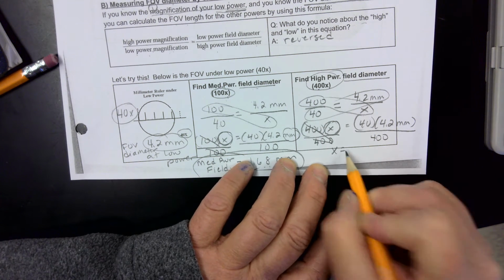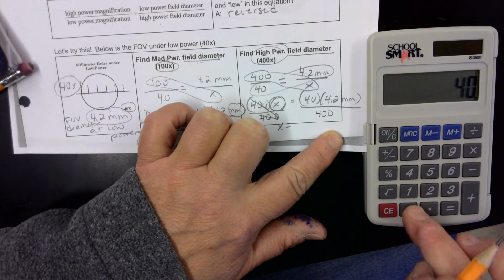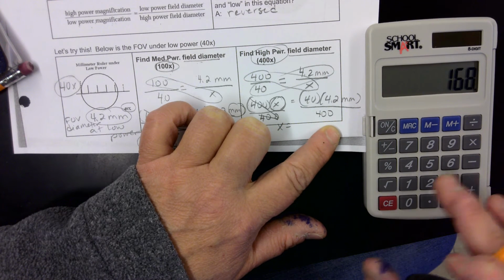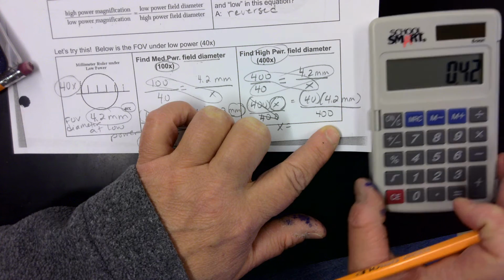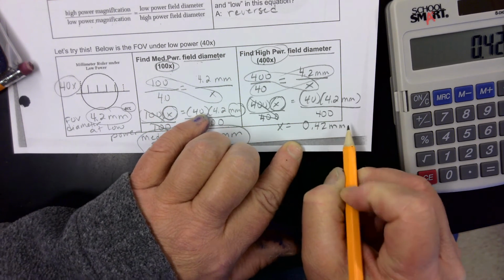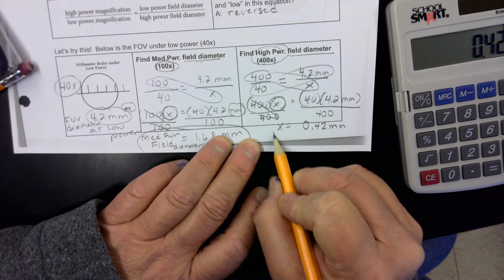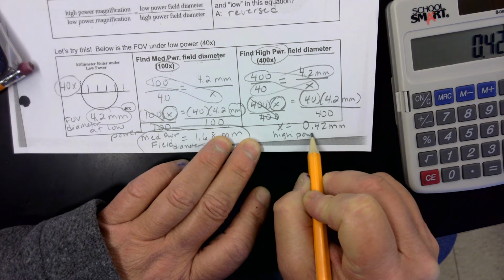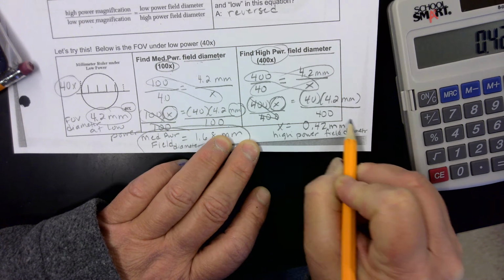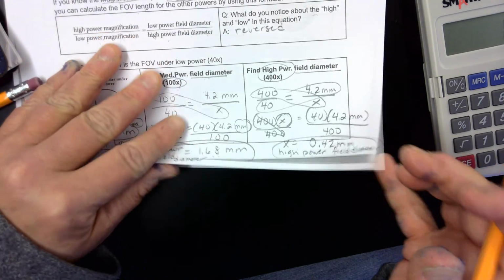So our math becomes 40 times 4.2, divide that number by 400. So now our field of view is even smaller at 0.42 millimeters. That's our high power field diameter, which makes sense. We're seeing less and less of that field as we magnify more and more.